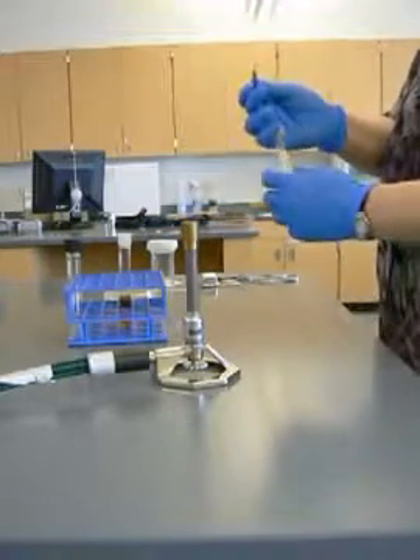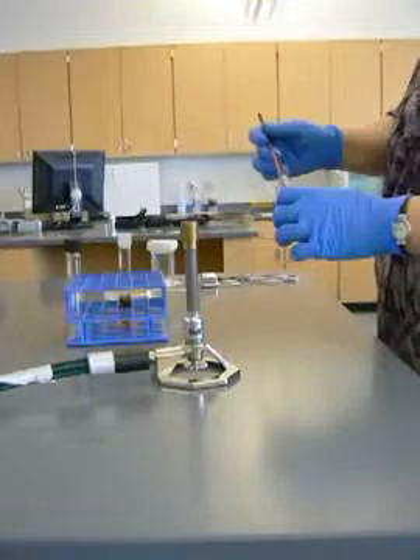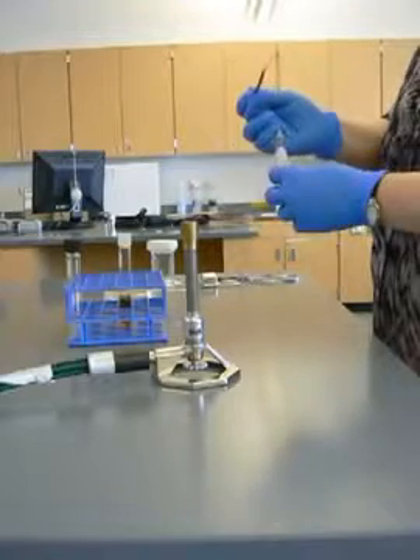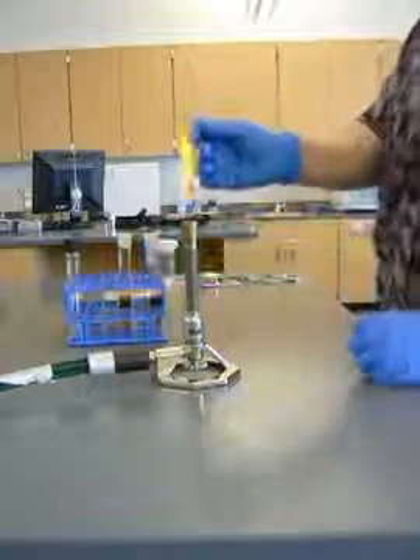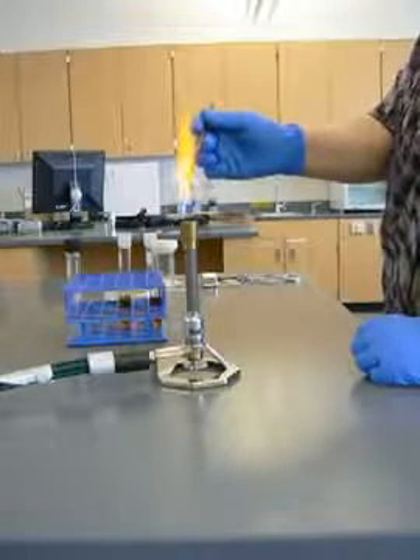I'm going to pass that through, put that in, come back out, flame, and there I go. Before I'm done, we're going to sterilize the inoculating loop before I put it down.